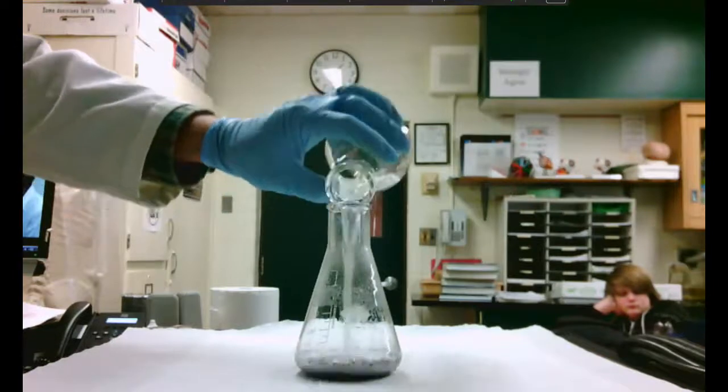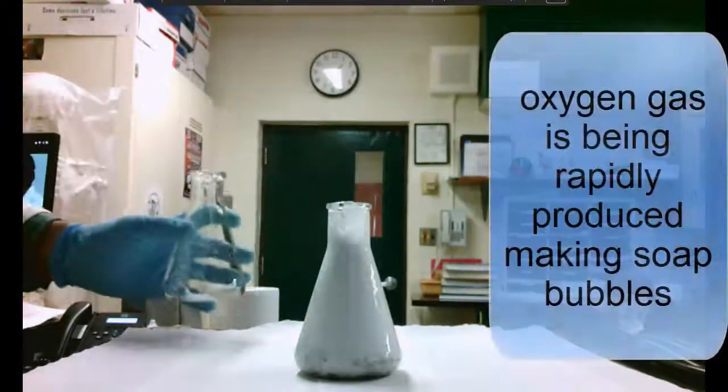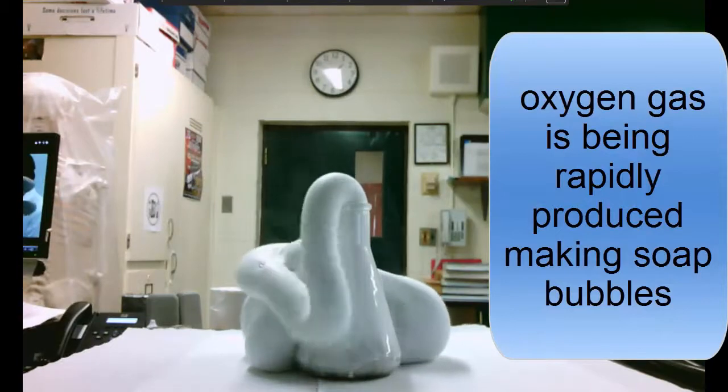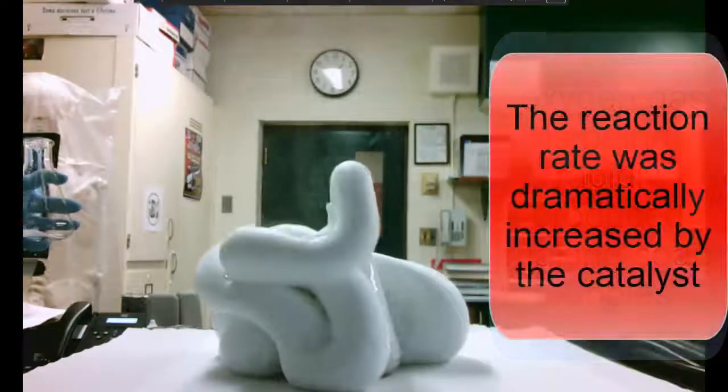But once added to the catalyst, the reaction rate is dramatically increased. Oxygen gas is being rapidly produced making soap bubbles.